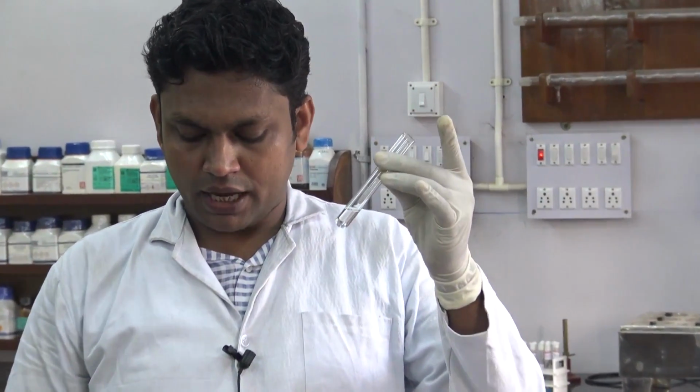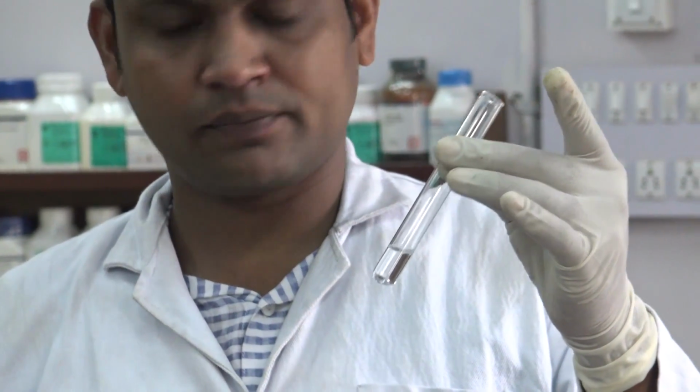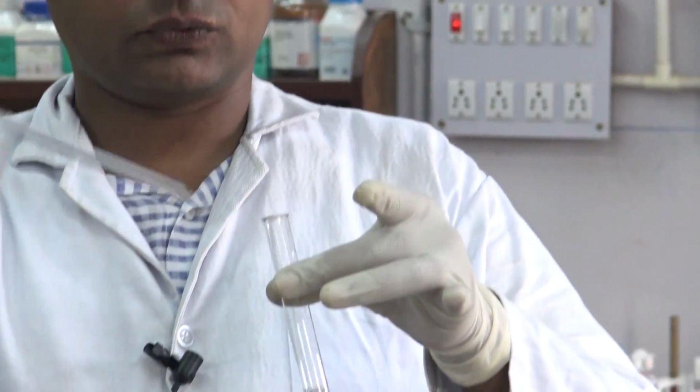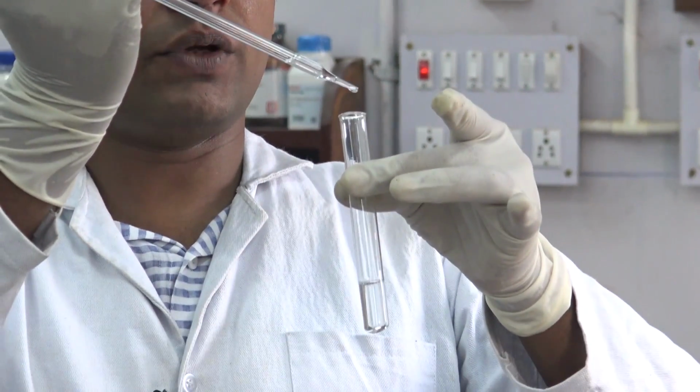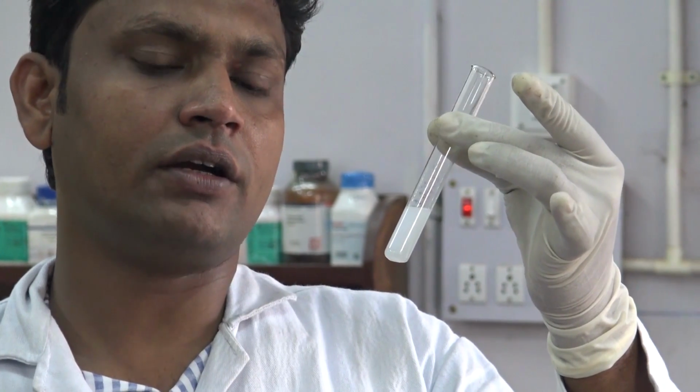For magnesium ion, use a pinch of ammonium chloride, then add a few drops of ammonium hydroxide. We can see a clear solution. Then add disodium hydrogen phosphate to it. A white gelatinous precipitate appears, which indicates the presence of magnesium ion in our test solution.